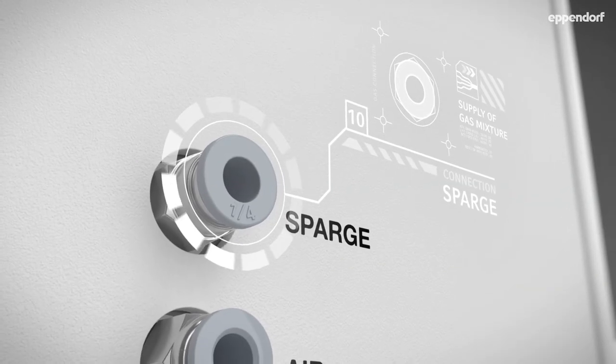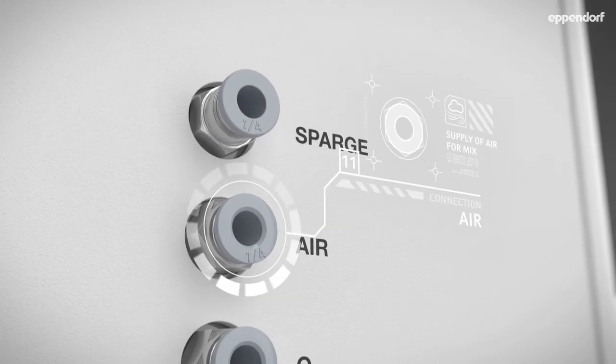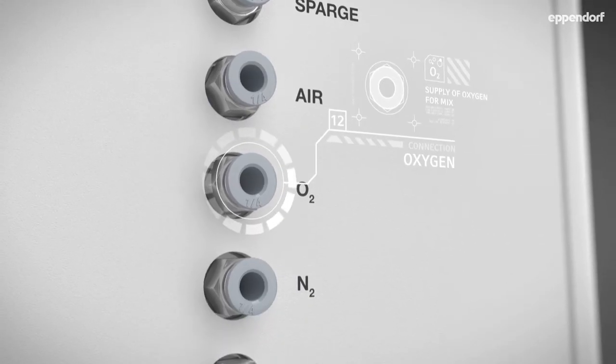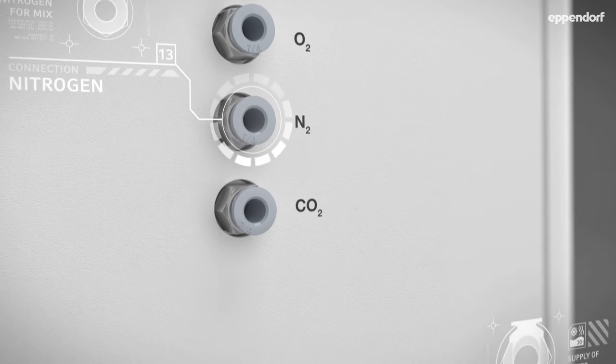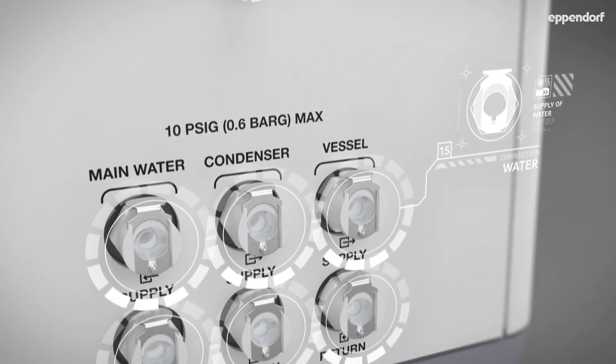Choose between a thermal mass flow controller or rotometer for sparge gas flow control. Four automatically mixed independent gas supplies are standard on every BioFlow 120. All water connections are easily accessible on the side panel as well.